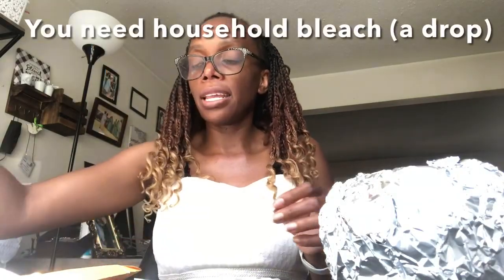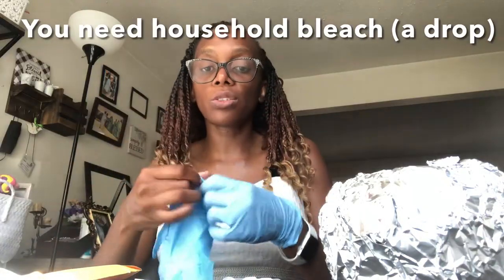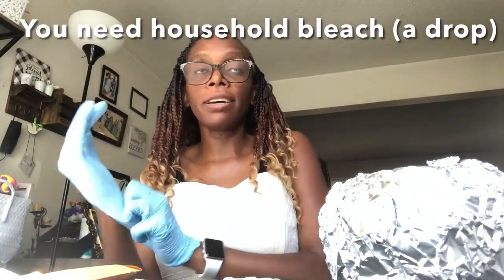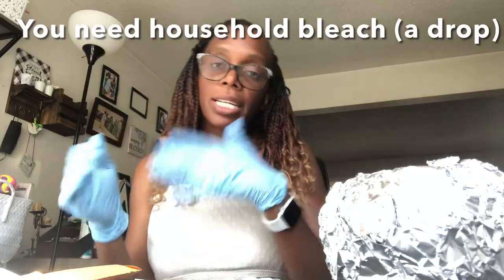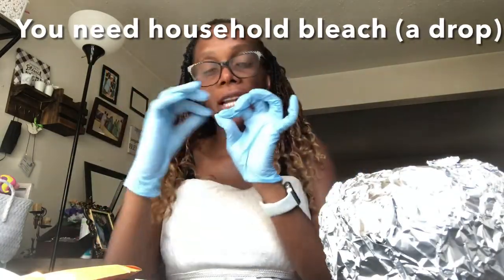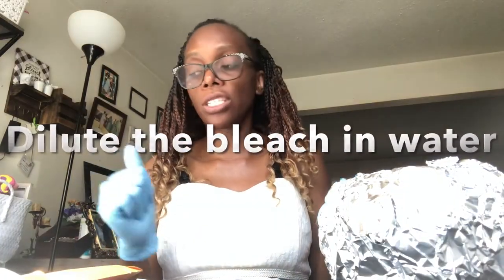Okay, and then make sure you get your gloves. So I'm going to start this, and I have my gloves. Oh, and then the last thing is we need household bleach. Like I said yesterday, for most of us, household bleach has a percentage of the active ingredient, sodium hypochlorite, of about 6%, 7%, 8%. And so we have to dilute it so that we have very little bleach and a lot of water. You don't want it to be super concentrated. We need just a low concentration of the bleach.